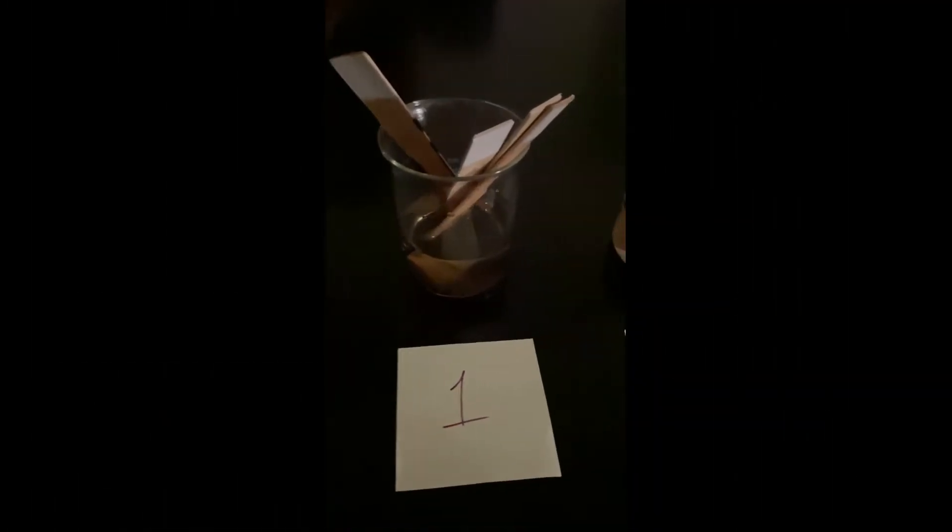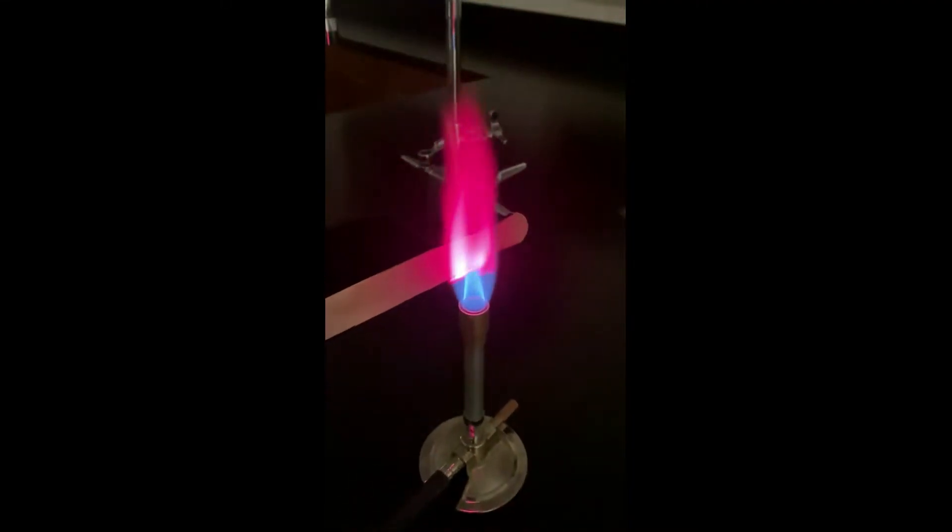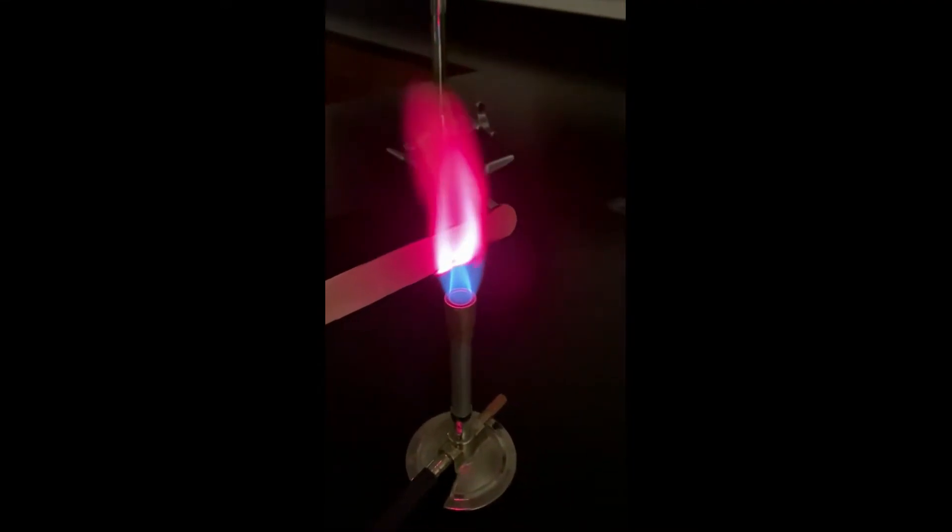All right, so let's go ahead and conduct the lab. Grab one of your popsicle sticks from station one. You want to tap it off so it doesn't have a lot of excess that's going to drip down into your Bunsen burner. Then go ahead, observe the color, look at your data sheet to see which one that matches, and stick it back into that beaker.